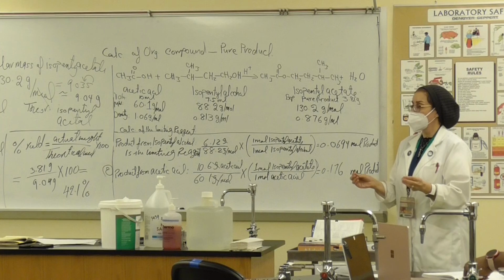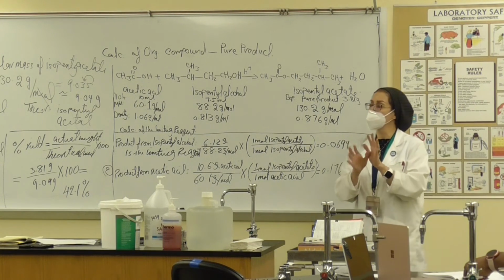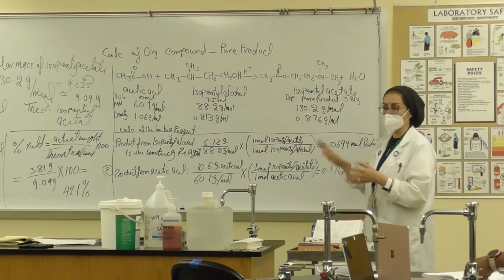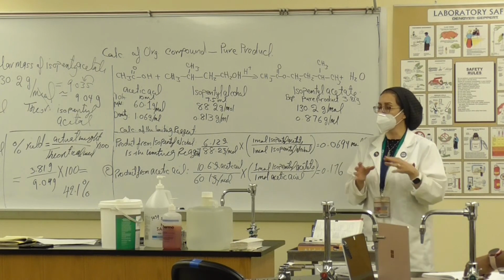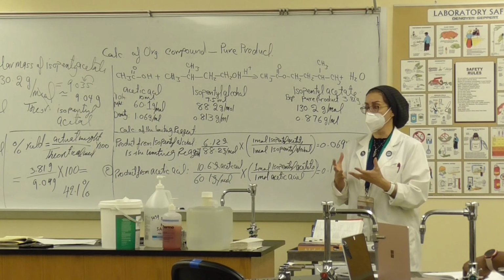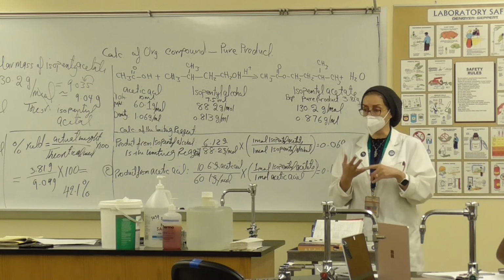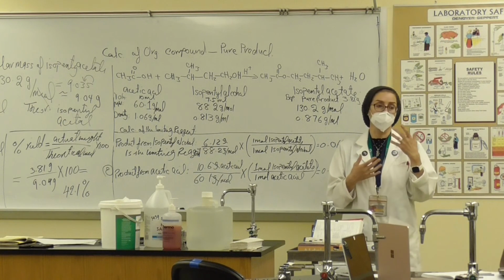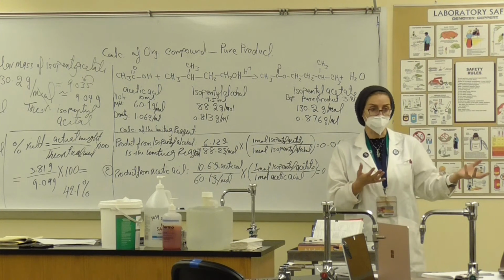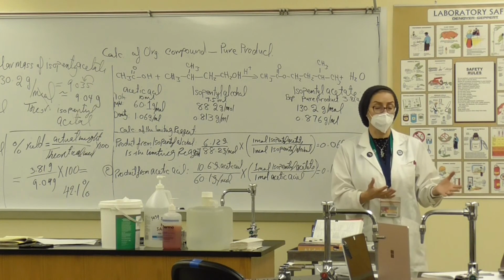In this semester, we are going to learn how to use all these techniques of preparing the pure product. And hopefully we will be able to do probably a couple of these, extraction and then collection of a pure product. But we're going to use extraction, purification, recrystallization, and also distillation, and column chromatography if we wanted to purify. So these are the techniques that you're going to learn.